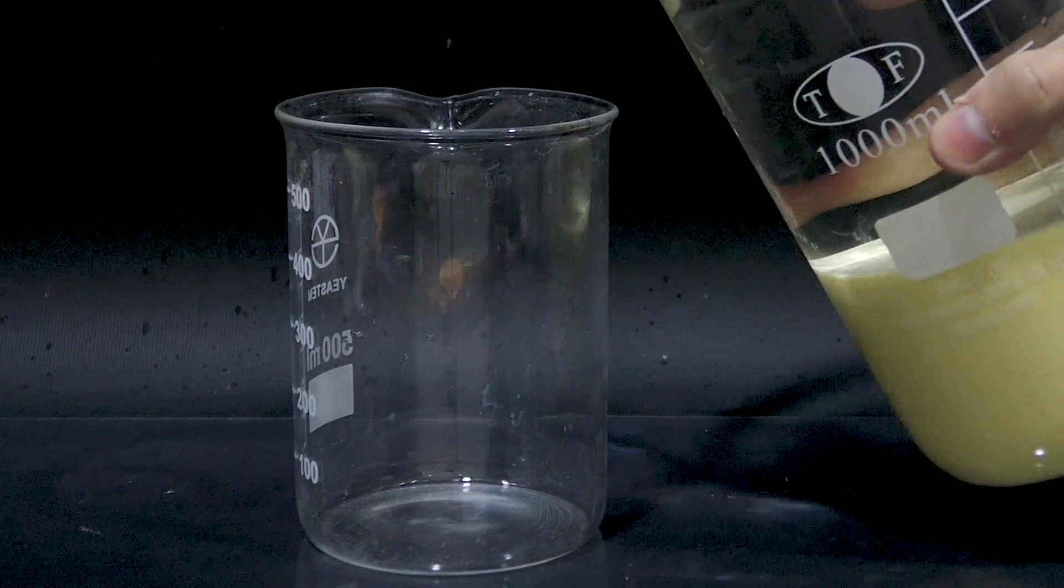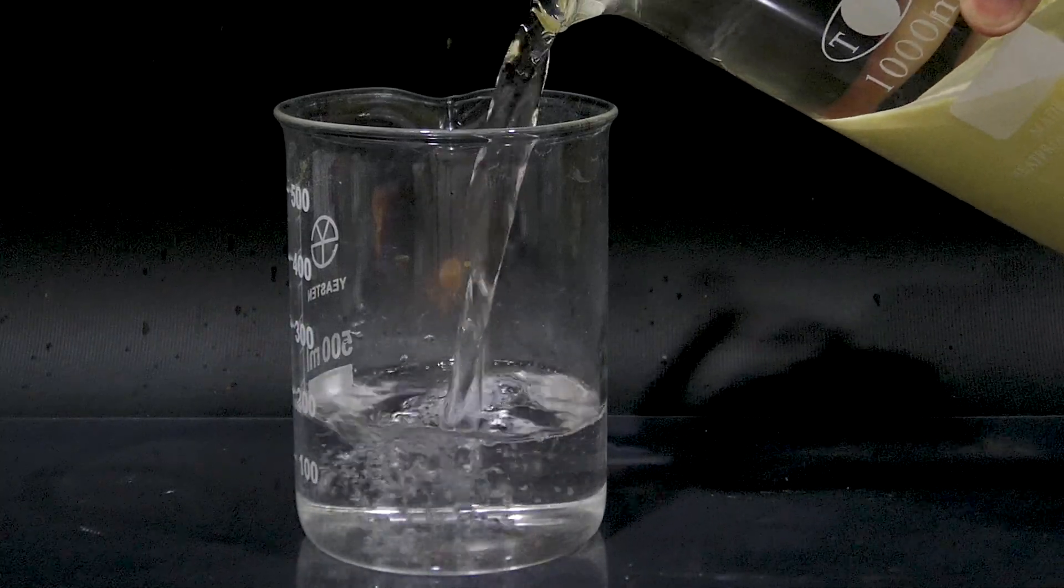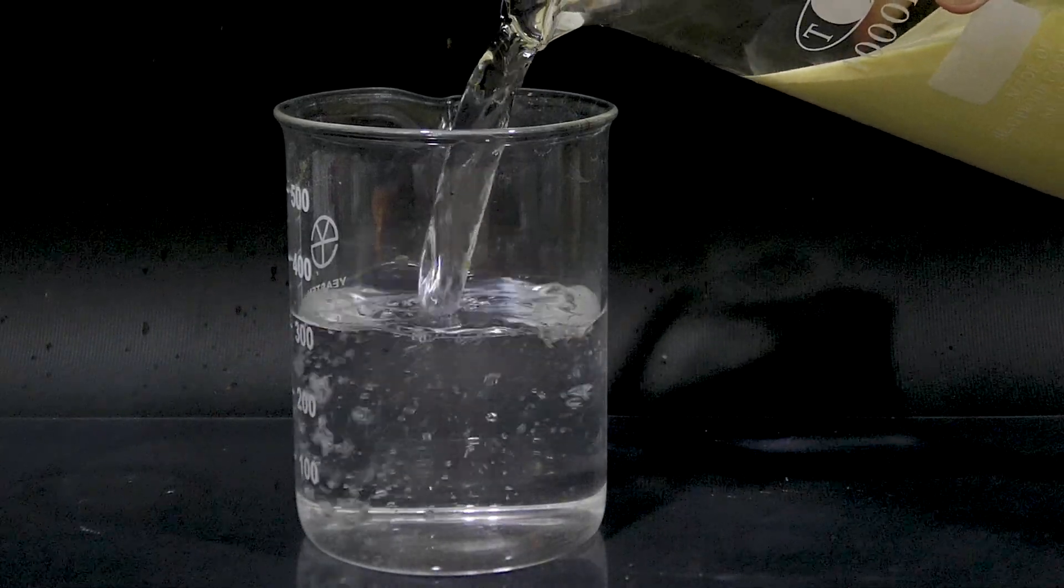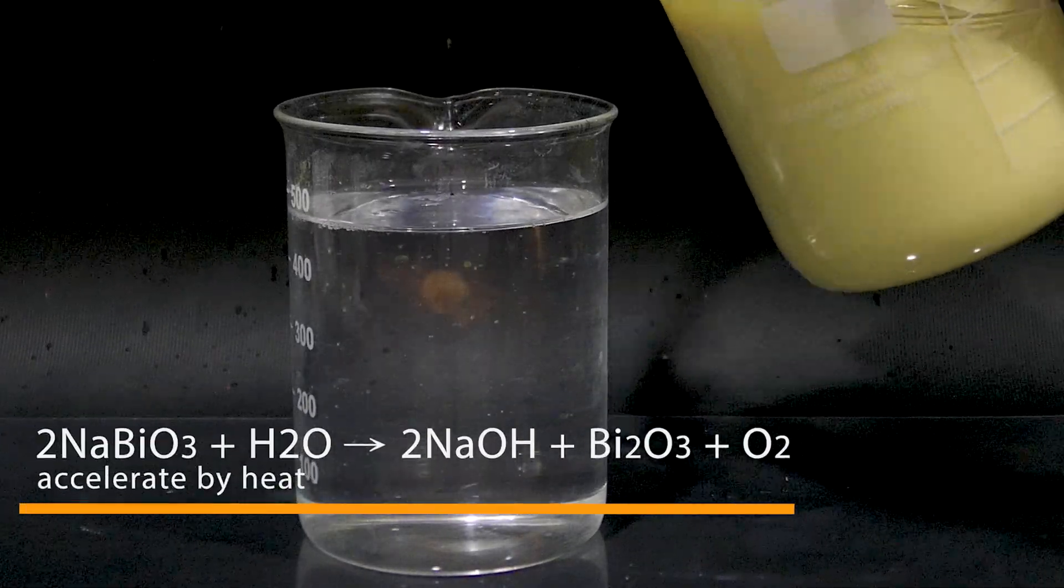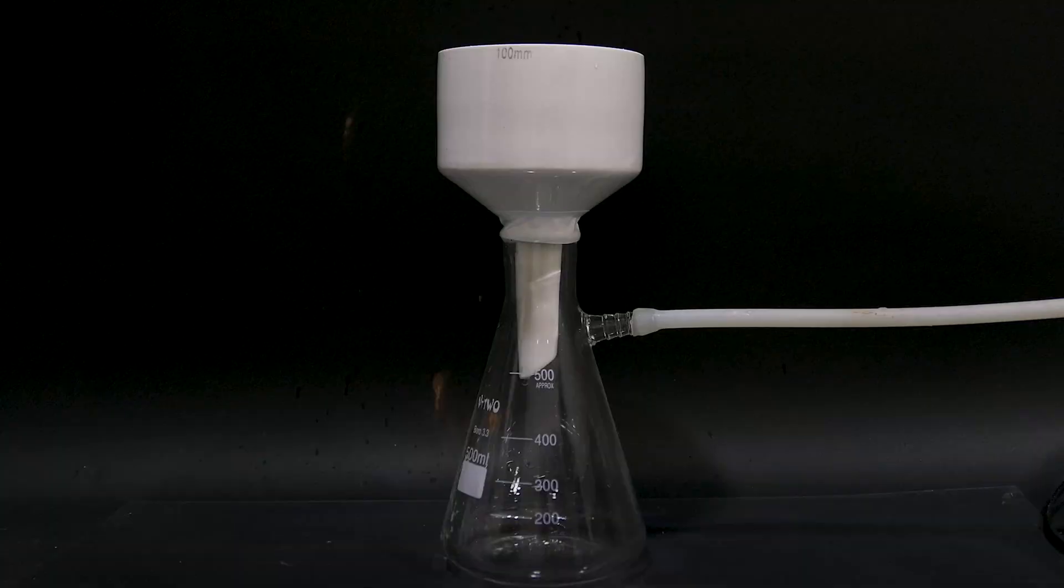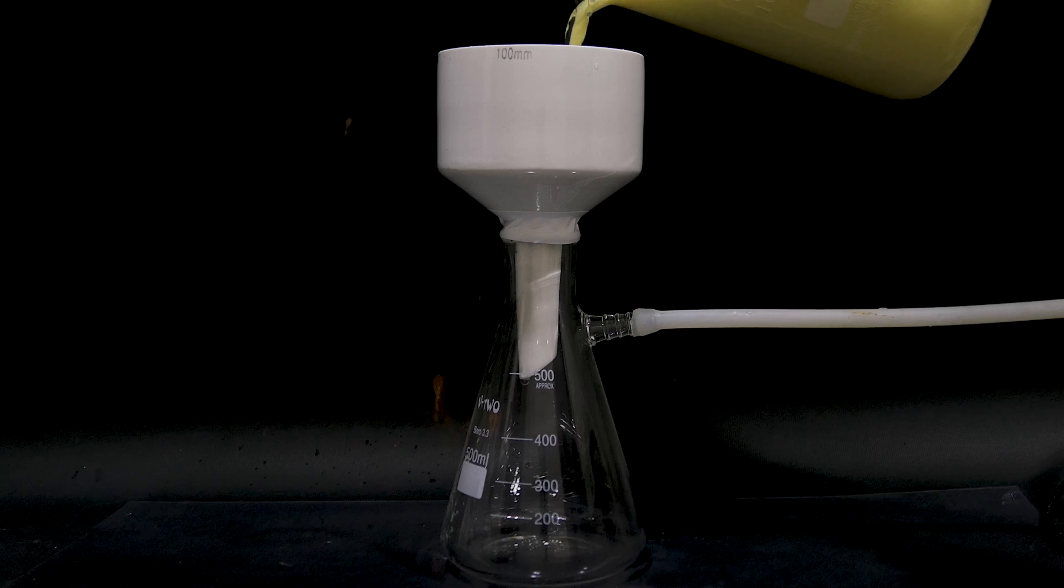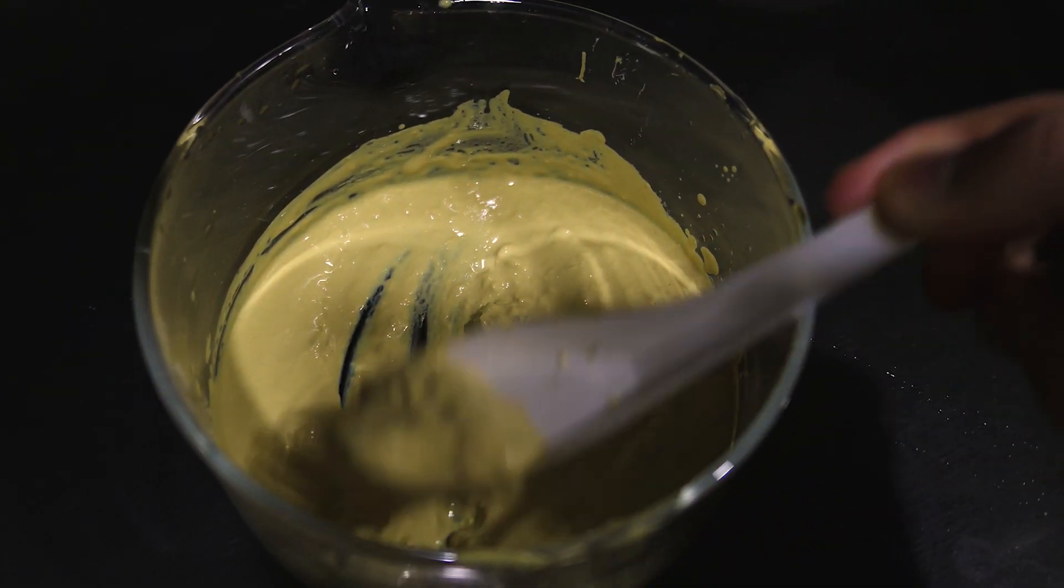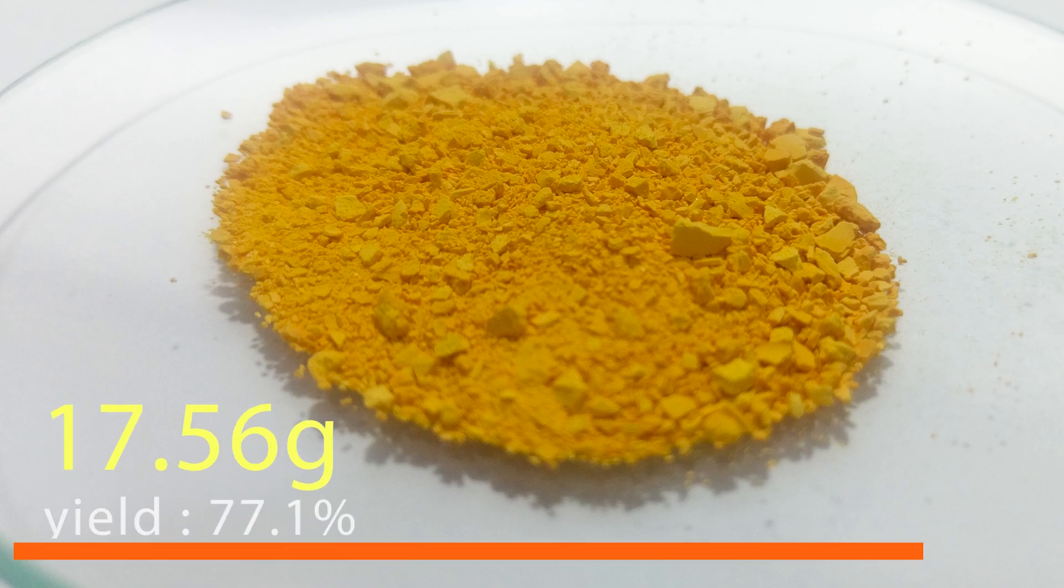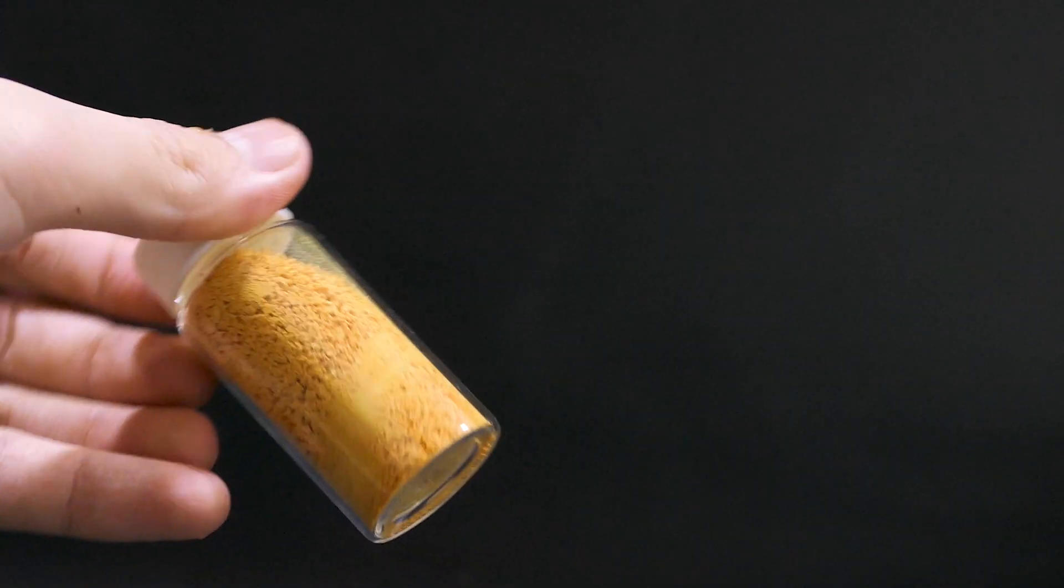When sodium bismuthate sank to the bottom, I remove most of the water. One thing you should keep in mind is that sodium bismuthate will degrade in water slowly, so you shouldn't leave it underwater for too long. Then I vacuum-filtered the sodium bismuthate. Then I put it in the desiccator to dry it. And this is the final product. It's quite interesting that yellow sodium bismuthate turned into orange, and it looked like the orange bismuth compound in the beginning of the reaction.